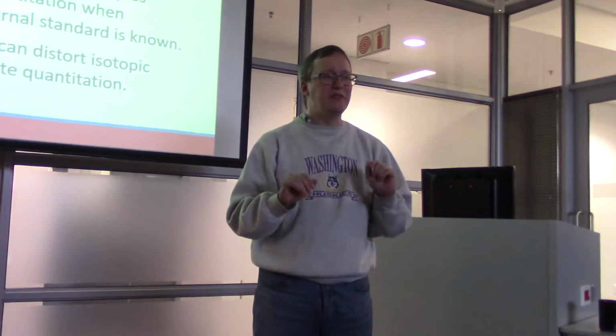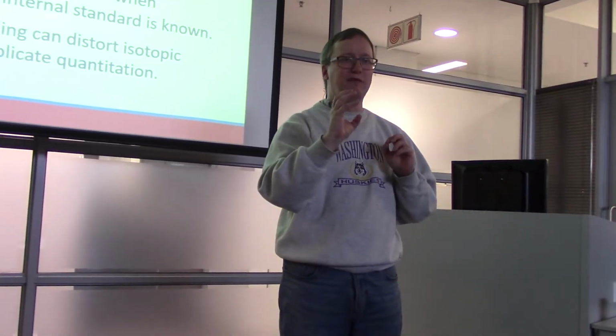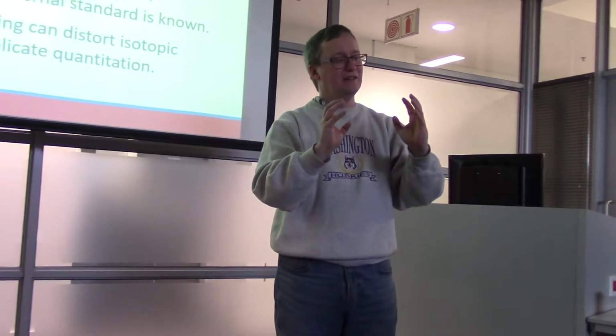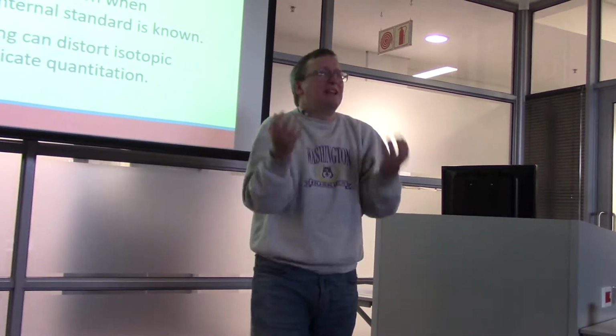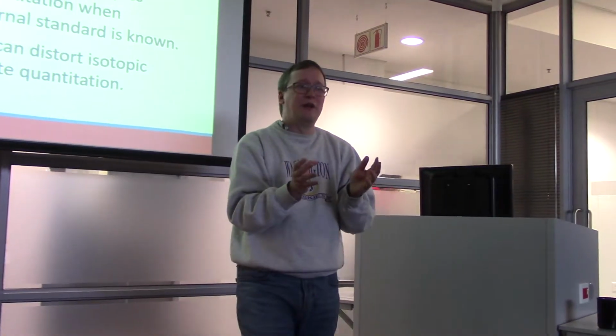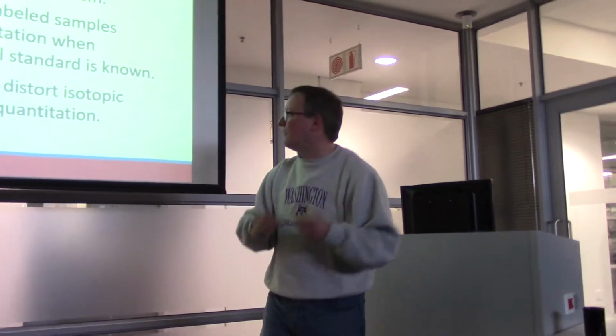But I would just point out then that they are taking their measured chromatogram for unlabeled peptides and comparing it to a heavy labeled version as well, which is already a relative process. So I would say that the term absolute quant gets thrown around very loosely in our field, when in fact it's all relative.